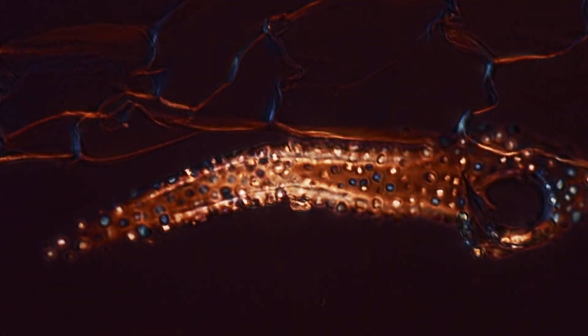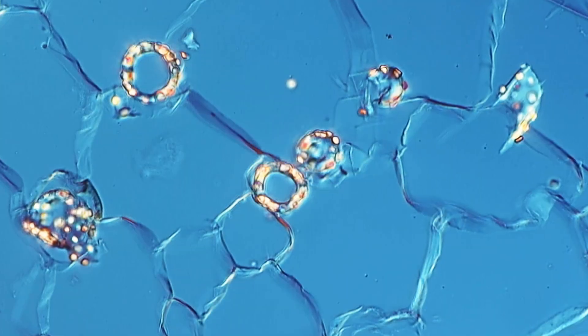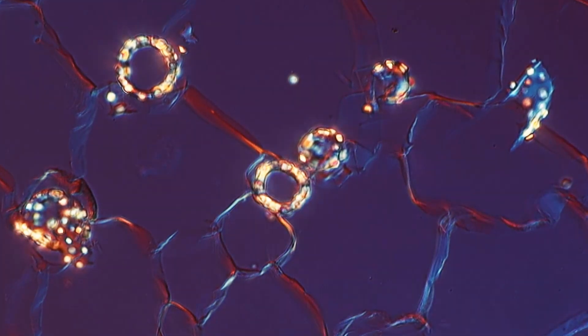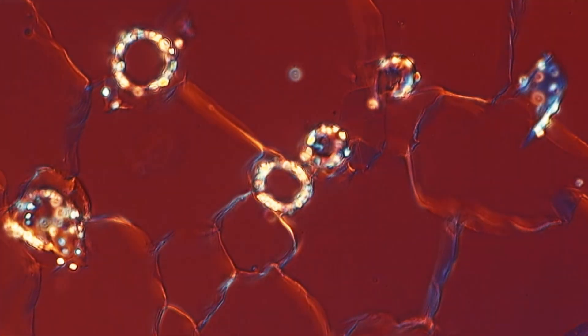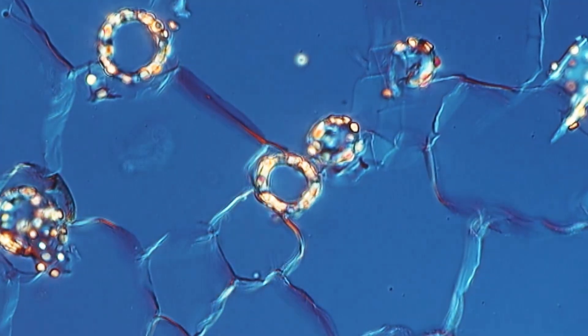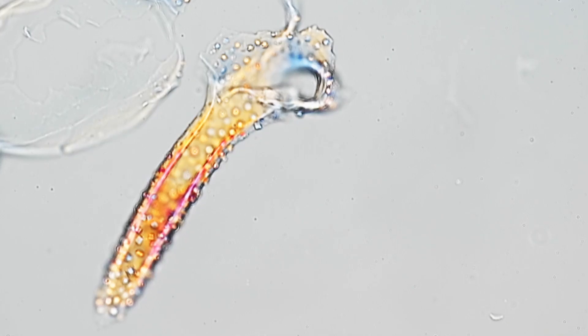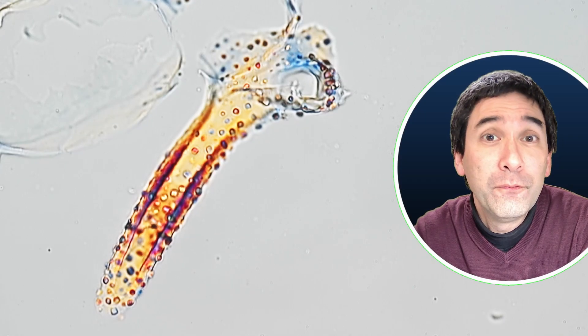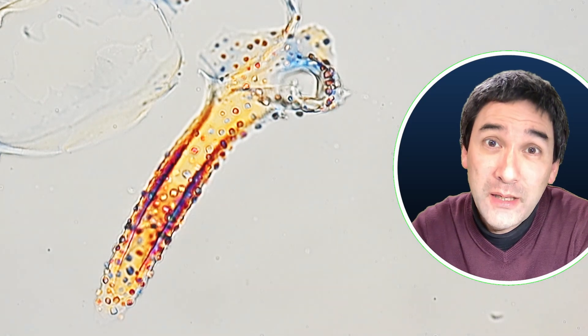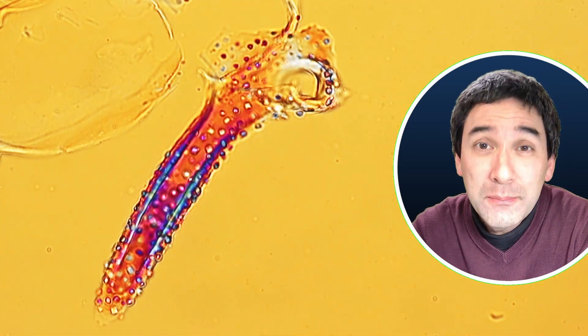The question is, of course, what do they do? Why do water lilies make those calcium oxalate crystals? While the function is not entirely clear, there could be different reasons. Several plants produce those crystals to make them more unattractive for predators to eat them, because calcium oxalate, at least in higher concentrations, can be toxic.